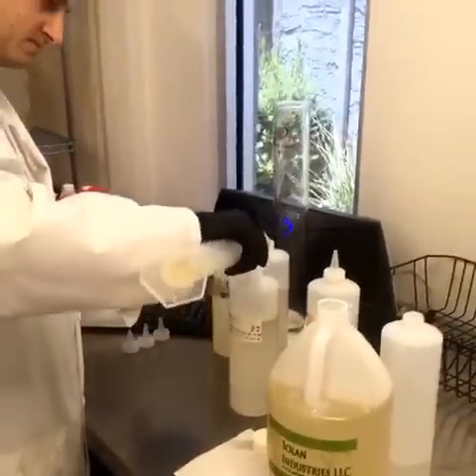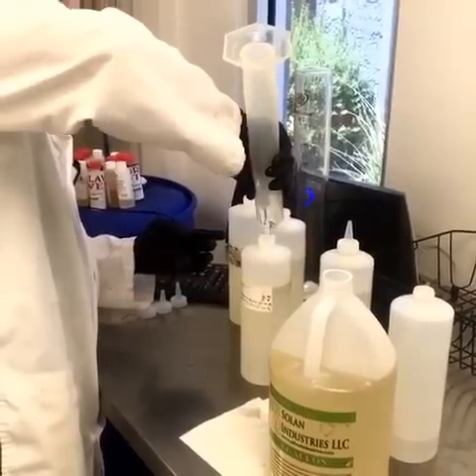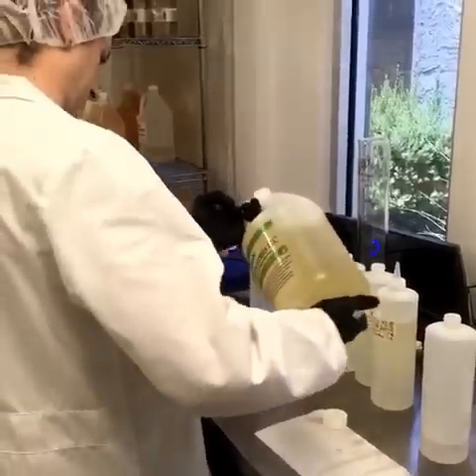So it's 100 milligrams per milliliter. That's 10% pure nicotine. Right, but how do you test to make sure? Do you want to run through that a little bit? Give me a second.